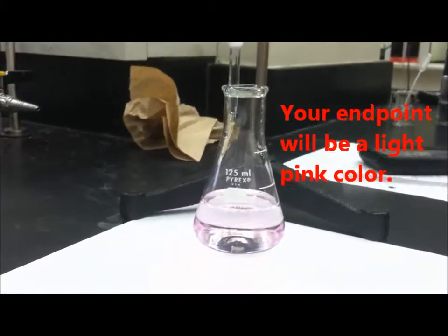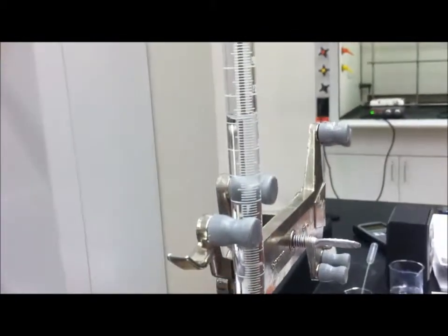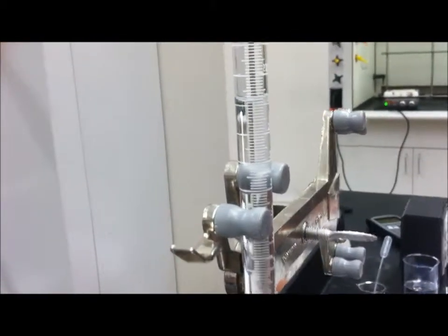Okay, so this is your end point. It's reached its light pink state, and we're going to record the final volume, which looks like 27.9 milliliters.